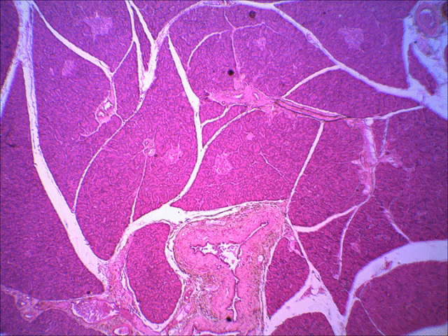All right. However, like I said, we're studying this as an endocrine organ, and so I want you to notice in several of these lobes, you also see some clusters that, to me, I just like to describe them as lighter staining. They just look different. Some of them are big, like this one up here on the top right, that I've got two arrows on. Some look tiny, like this one in the center at the top. But these are the endocrine areas. They're called the islets of Langerhans, or pancreatic islets.